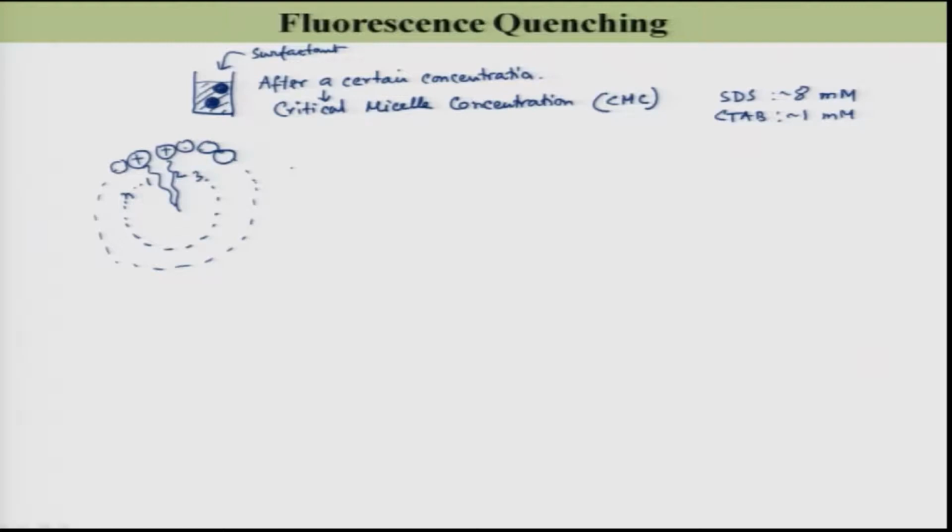For micelle formation from the surfactant, I encounter two things. One is the critical micellar concentration, and beyond it, n surfactant molecules will form this micelle, and that is called the aggregation number, denoted as n AGG. Now, my question is how we are going to experimentally determine this CMC and this n aggregation.